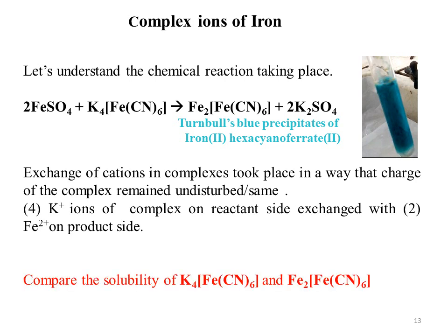Now we have to compare the solubility of these two complexes. It is well understood that potassium ferrocyanide is a clear yellow solution, so this compound is soluble in water, while as you are having the Turnbull's blue precipitate of iron 2 hexacyanoferrate, so iron 2 hexacyanoferrate 2 is a water insoluble compound.